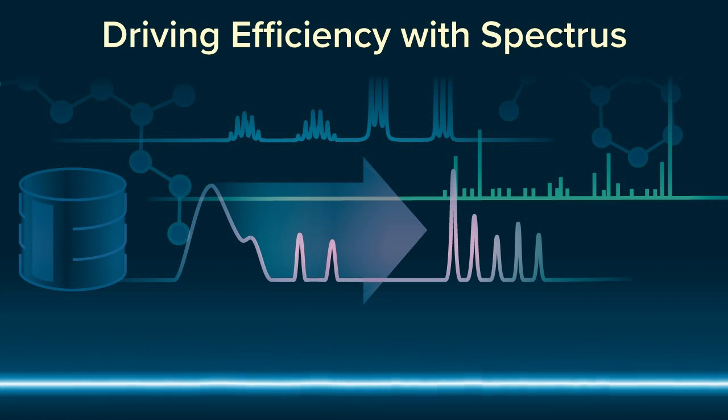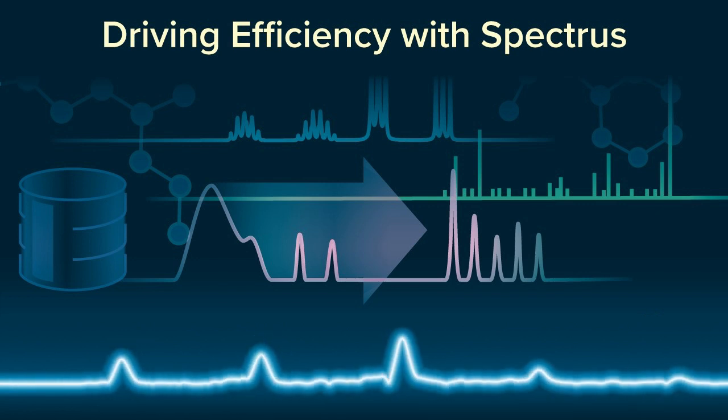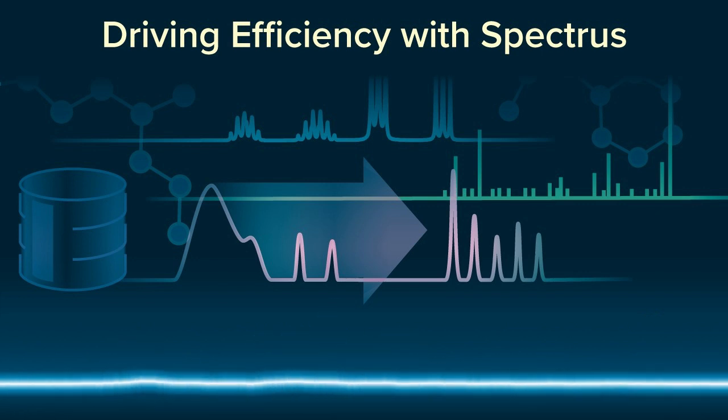So it has well-developed search. Like here, for example, you can perform a basic search based on the sample ID and using some logical operators, but since it has a lot of metadata, you can also search data using such parameters as NMR probe head number, which is shown here, and you can also add logical operators and look at the data acquired at some specific time frame, for example.